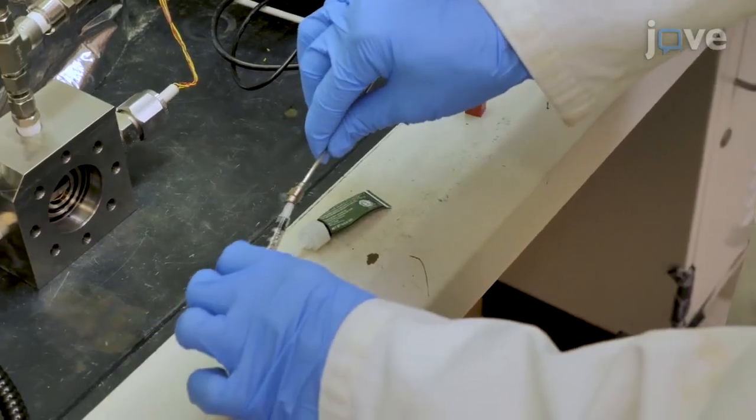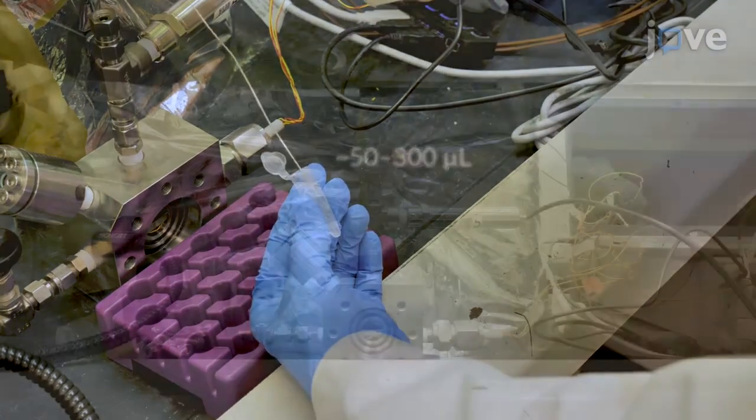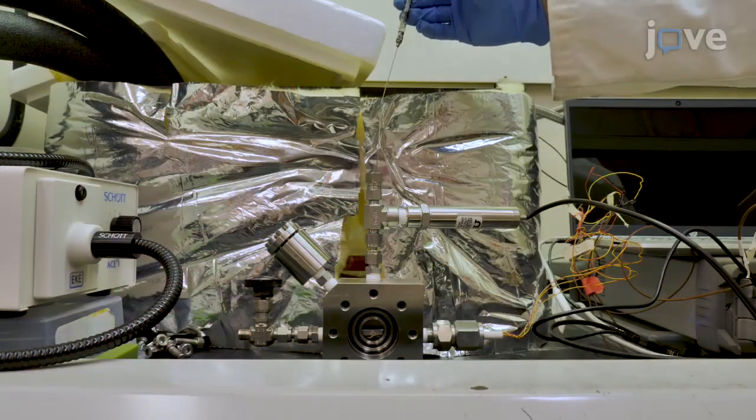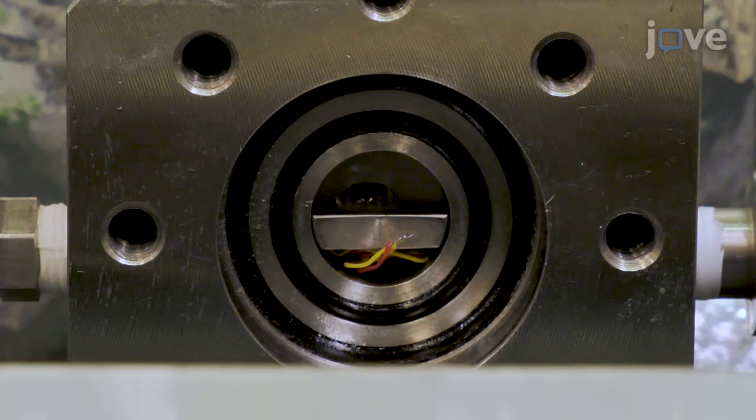Attach a 1 mL syringe to the cannula and pull in the desired volume of deionized water. Without the needle valve or sapphire window attached, insert the end of the cannula into the top port and practice expelling the droplet onto the center stage.